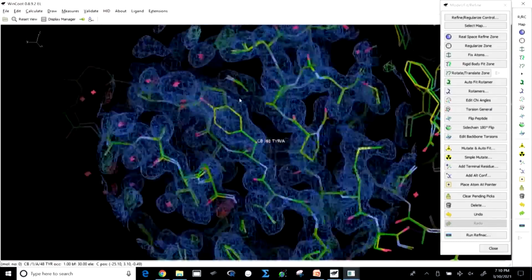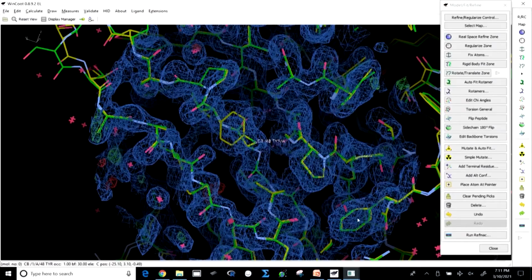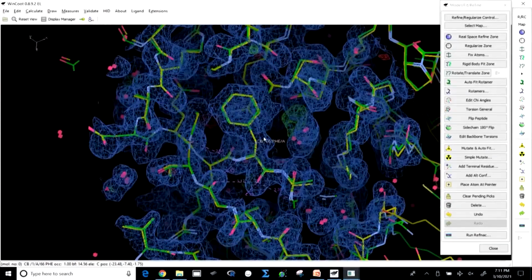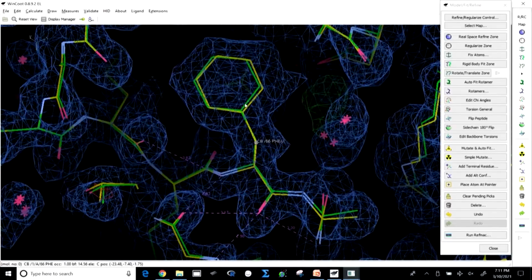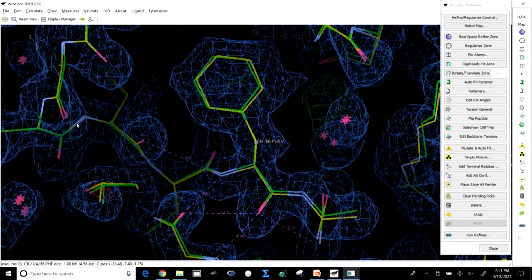What else could we do? We could show how you could use a rotamer. Like as this is here, you want to get the other rotamers, you see you will get 1, 2, 3, 4, 4 different conformations of the rotamer. We do not include it.